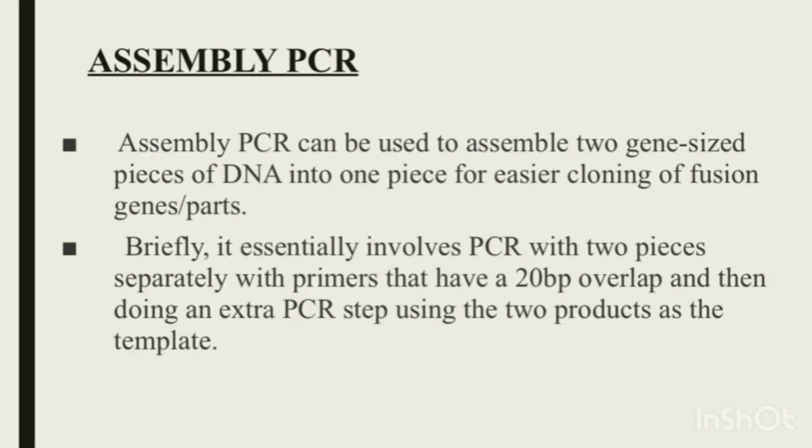So coming to next is assembly PCR. Assembly PCR can be used to assemble two gene-sized pieces of DNA into one piece for easier cloning or fusion gene or parts.